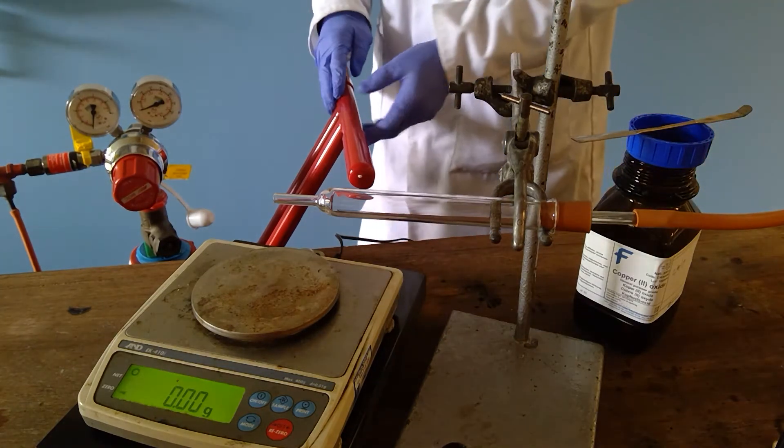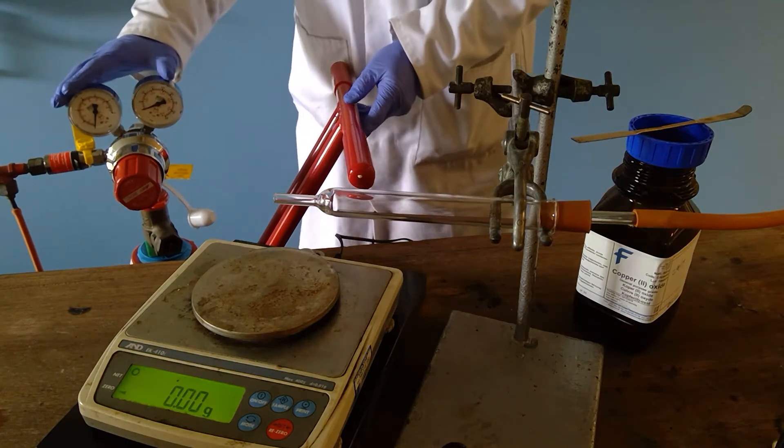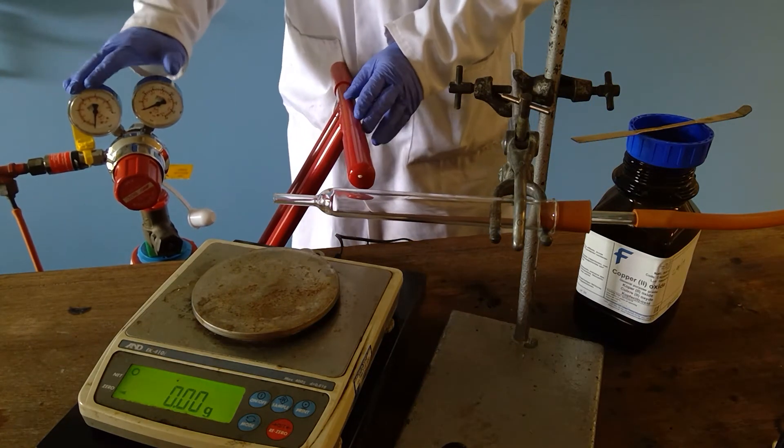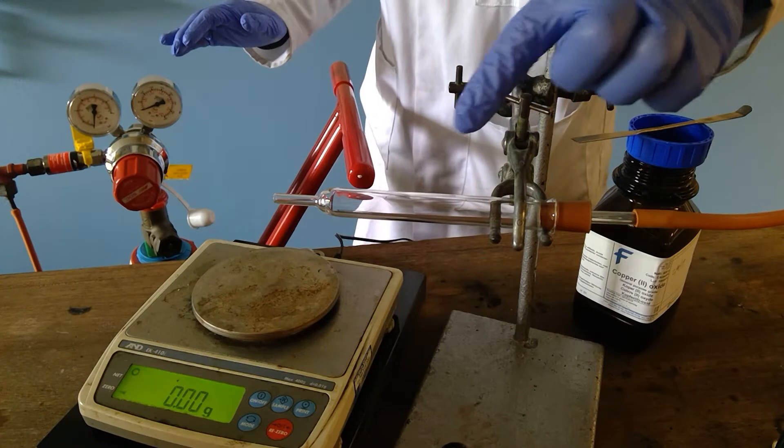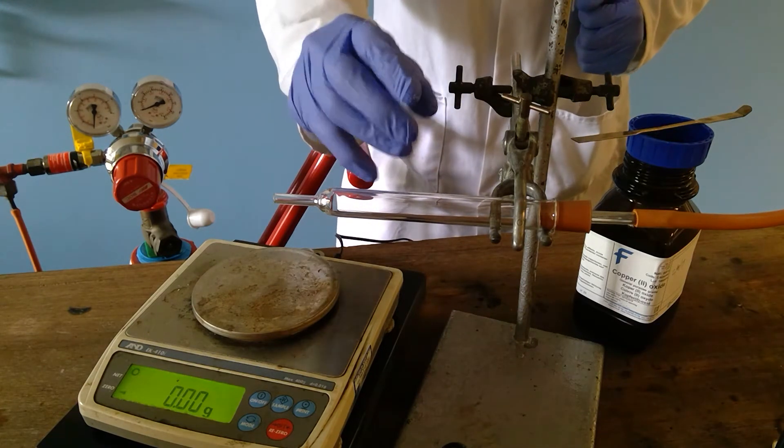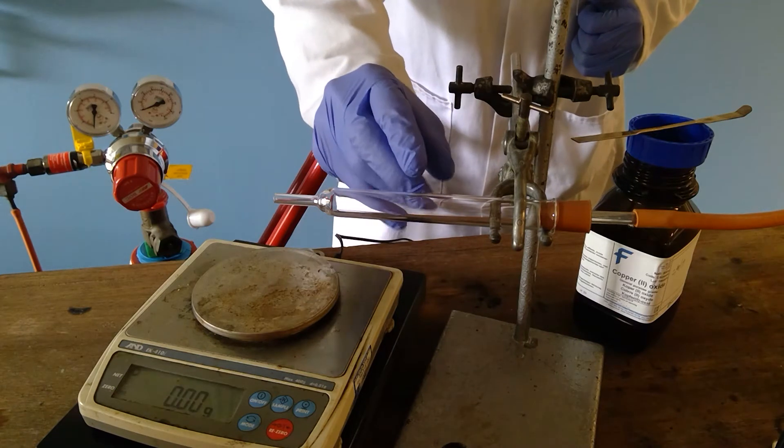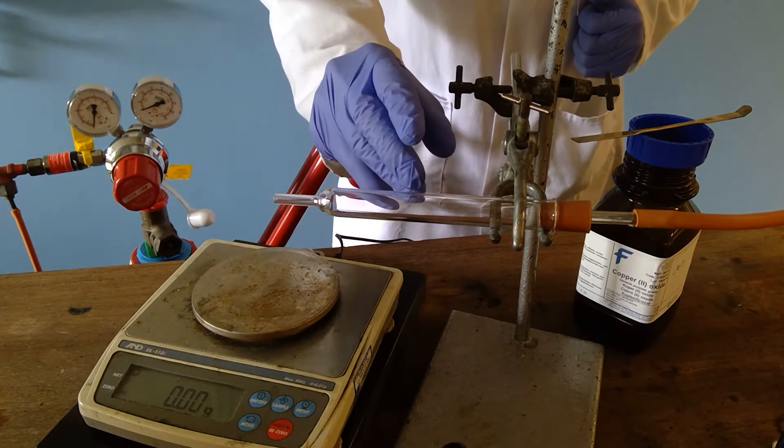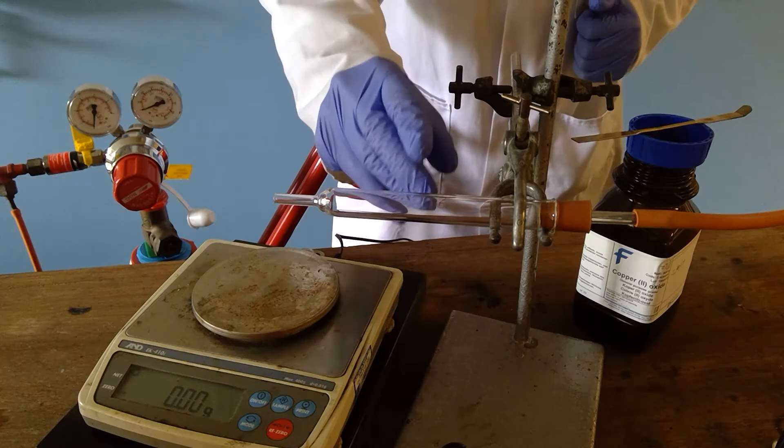The gas that we're going to pass over, hydrogen, comes from a cylinder. We will pass the hydrogen across the copper oxide, which will be in this combustion tube. The combustion tube will be heated, and the copper oxide reacts only with the hydrogen when it is hot.